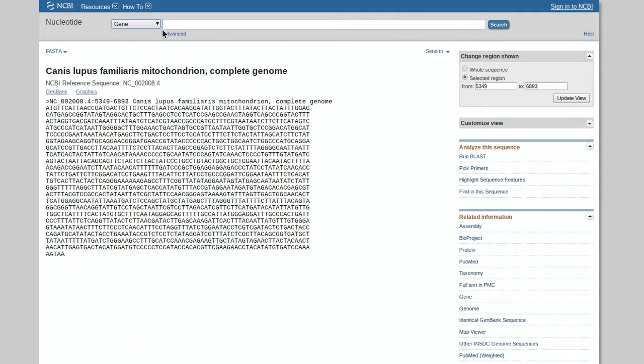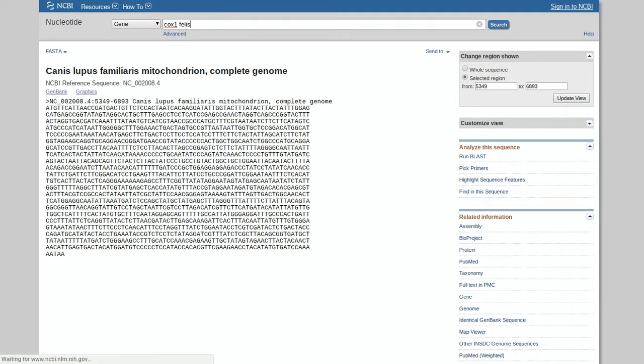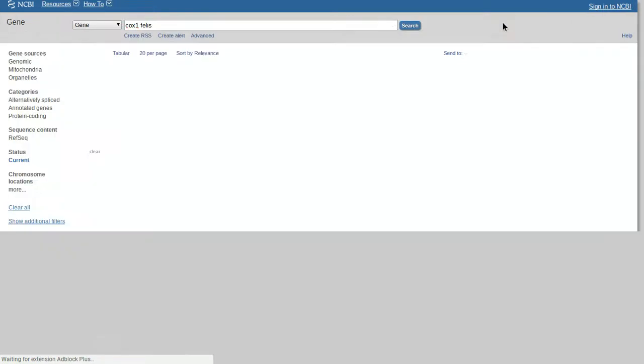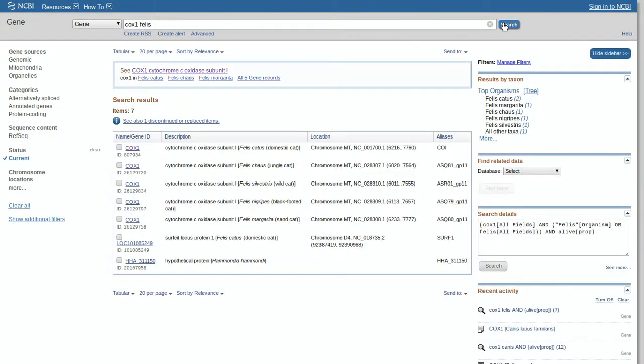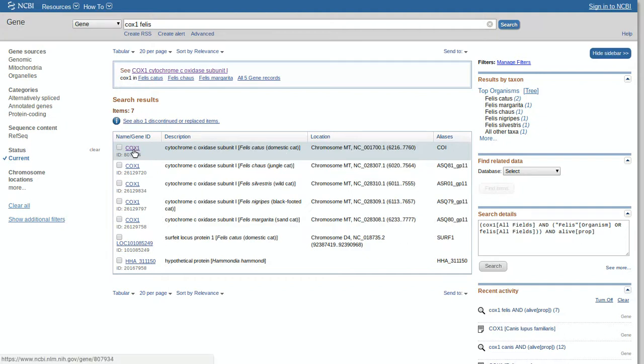We're going to go to gene and then type in COX1, because that's the gene we're coding for, we're aligning. And we're going to type in another genus, let's go Felis, cats. Cats and dogs, a little stereotypical. Search. Here we go. Let's say we're going to do domesticated cat and domesticated dog. You select name, gene ID, just click COX1.